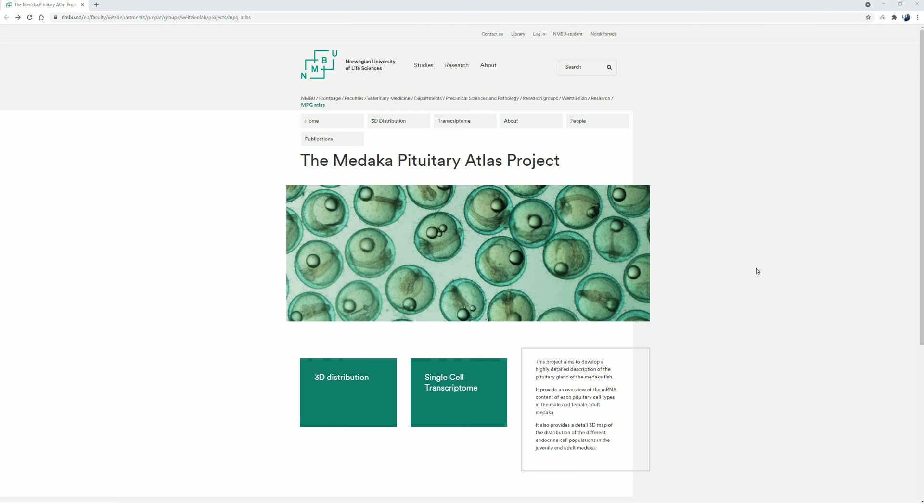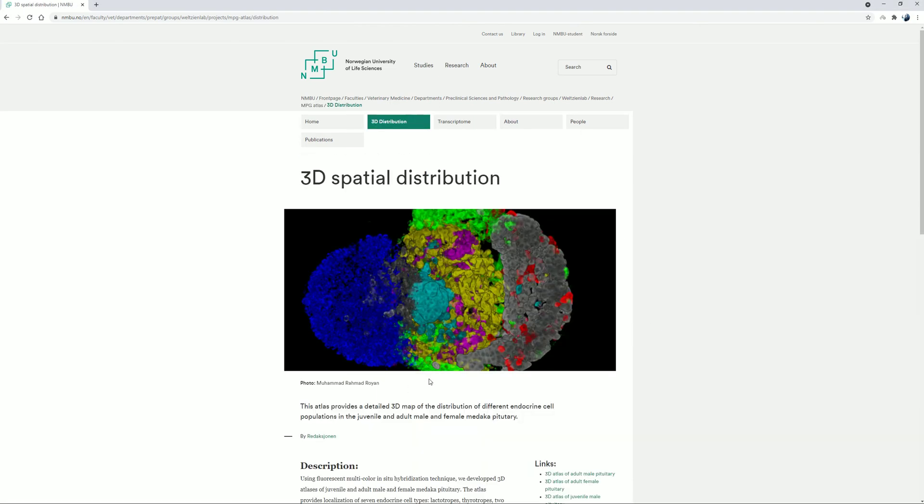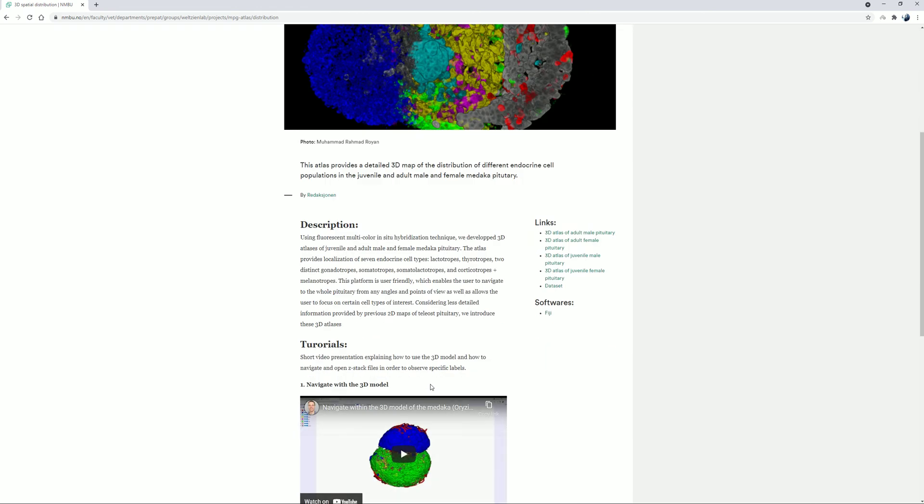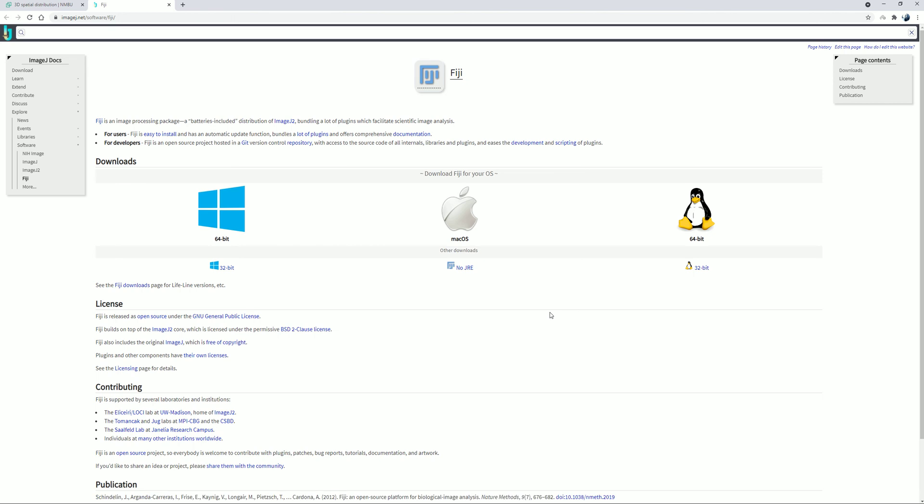In case you haven't installed this software in your computer, simply click on the 3D distribution menu and scroll down until we find a software link in the right side of the webpage. Click on this link and it will direct us to the ImageJ download website. Click on the thumbnail link that corresponds to our computer specification and just install the software.